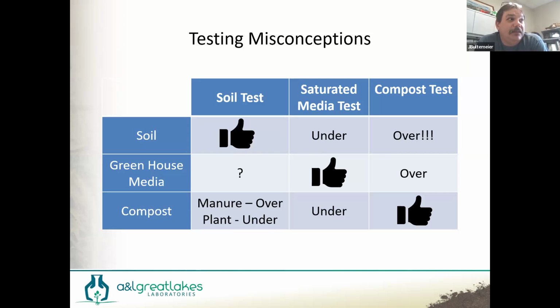And if I do a saturated media test on the compost, there's very little nutrient in the liquid fraction of compost other than potassium. Most everything is in the organic fraction. It needs to break down over time. It needs to decompose. And I will underestimate.